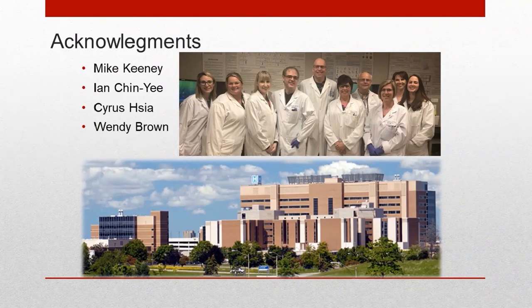So in one of the cases, there was a very sparse population of plasma cells that were CD38 positive. What is your view on the HLA-DR expression in this case? Is it a true positive or possibly appears positive due to spillover of bright CD38 in the HLA-DR channel? Oh, I would have to answer that one offline to the person. It is entirely possible.